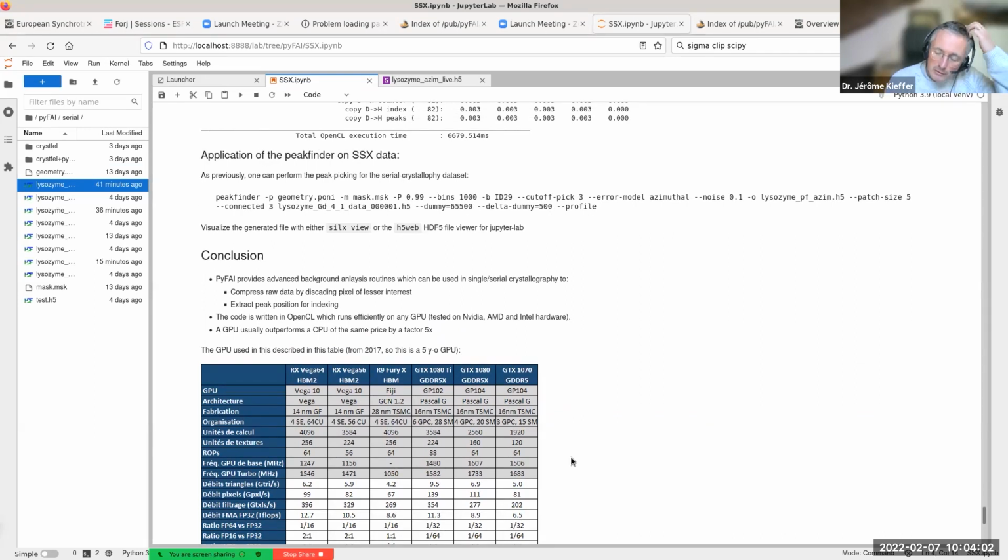That's it, and maybe just one side comment. This peak finder tool was abused to perform X-ray localization of crystals. In MX, when you do X-ray centering, you can use this to reduce a 2D grid and localize precisely where your crystal is physically.